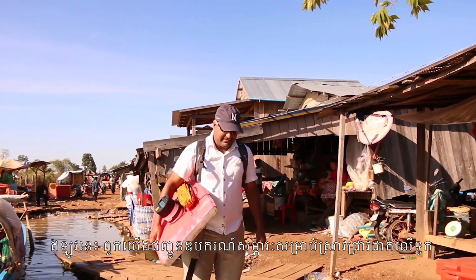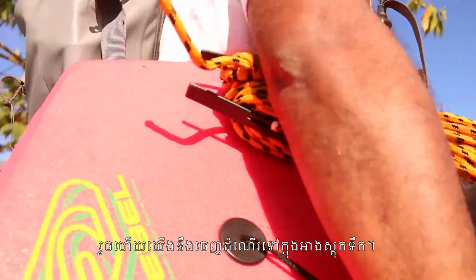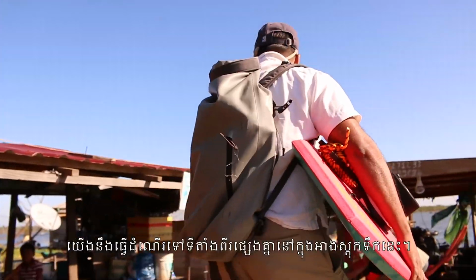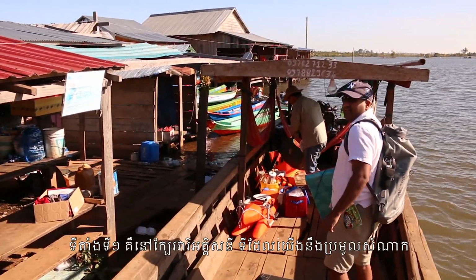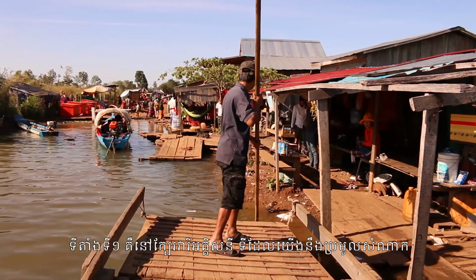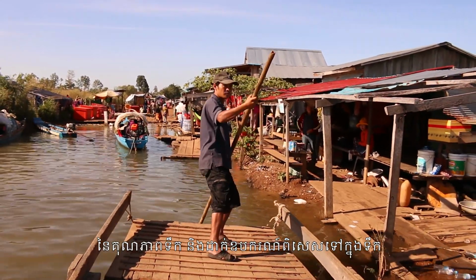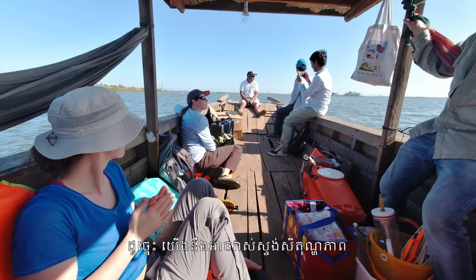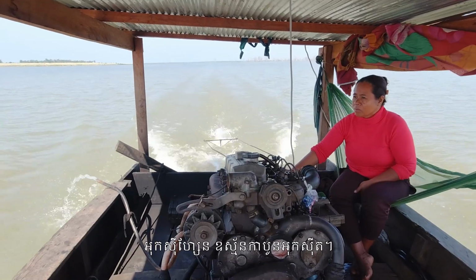We've loaded our equipment on the boat, and now we're going to take this boat onto the reservoir, and we're going to go to two different locations on the reservoir. The first location is closest to the dam, and there we'll collect our samples for water quality and also put special probes into the water so we can take measurements of temperature, oxygen, and carbon dioxide gases.